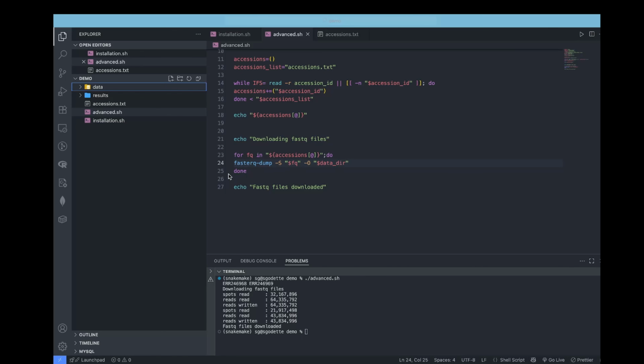Now, the next step in bioinformatics analysis is to run the FastQC program. The FastQC program will allow us to visualize the quality of the data we have and perhaps inform us whether we will need to do any kind of trimming for our data. Now, remember that we want the quality for each and every data file that we have. Here we have about 4 files, so we need the data metrics for all these 4 files. If you had 100 files, then you will need the data metrics for all those 100 files.